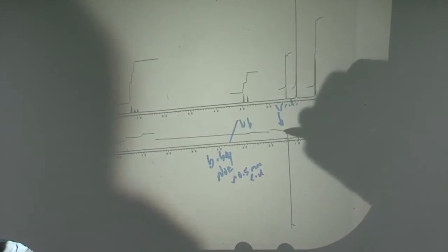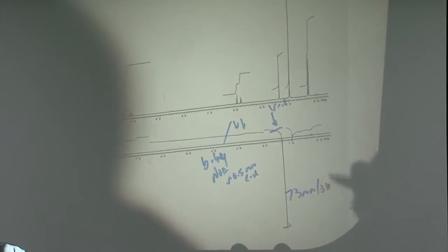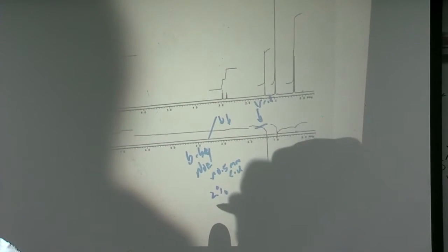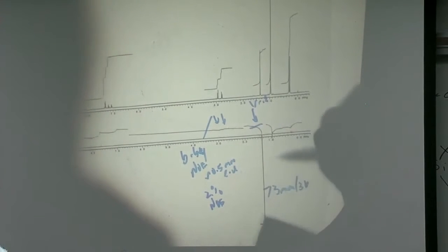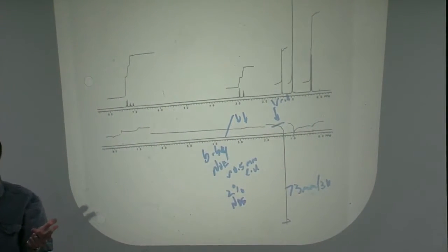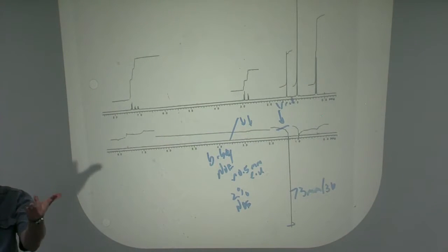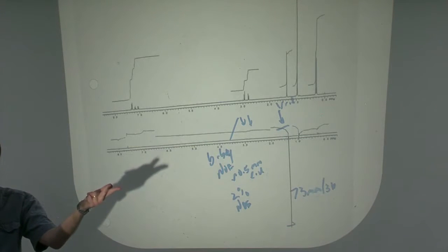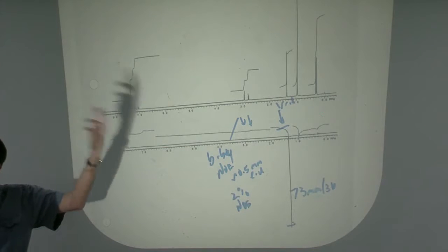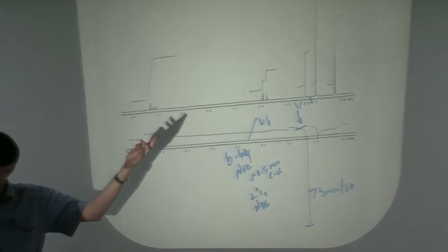And this one on this particular example was about 73 millimeters for 3 hydrogens. So that ends up to about a 2% NOE. And it's nice, with both diastereomers in hand. That's great, we've done a comparison. Hey, you irradiate one diastereomer's methyl group, you get a nice NOE. The other, you get a little NOE. The first one is cis, B is cis, A is trans.